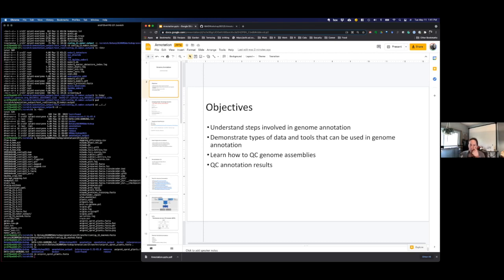So trying to gauge if you accurately captured the coding regions in the genome. And you'll see that annotation is never 100%. You try the best you can to get good gene models, but there's always going to be problems because you're just relying on in silico predictions. So you can get them pretty good, but usually the best annotations have some human intervention involved, manual curation.